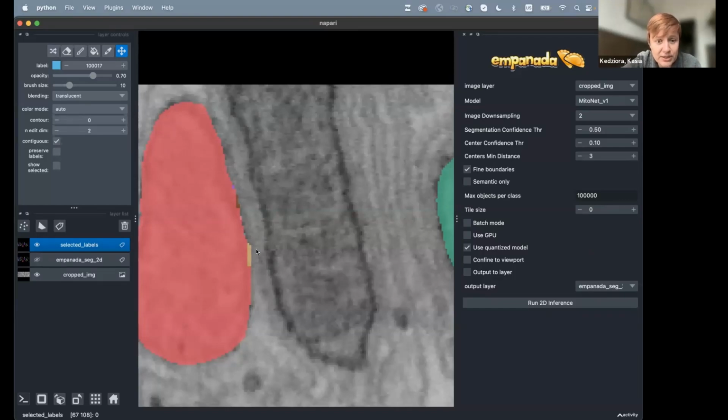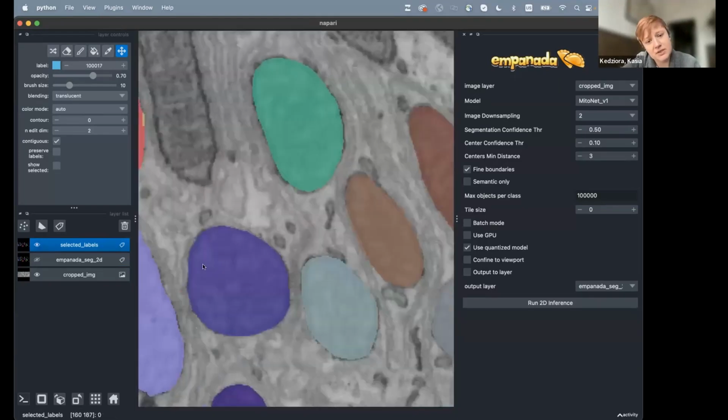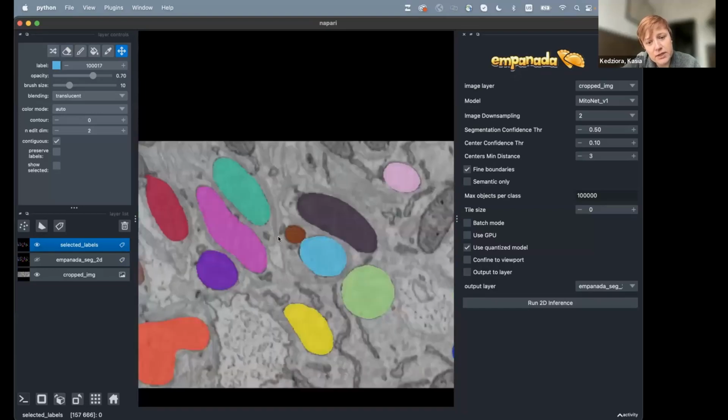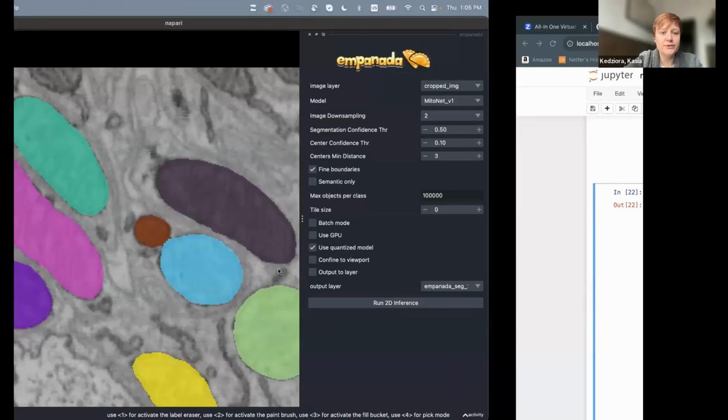I learned that these are the objects that are definitely not true mitochondria. Not very surprising, but also that they probably don't really matter much in the quantification of other objects. So the easiest solution to get rid of these edge artifacts from my final quantification would be just to get rid of them.